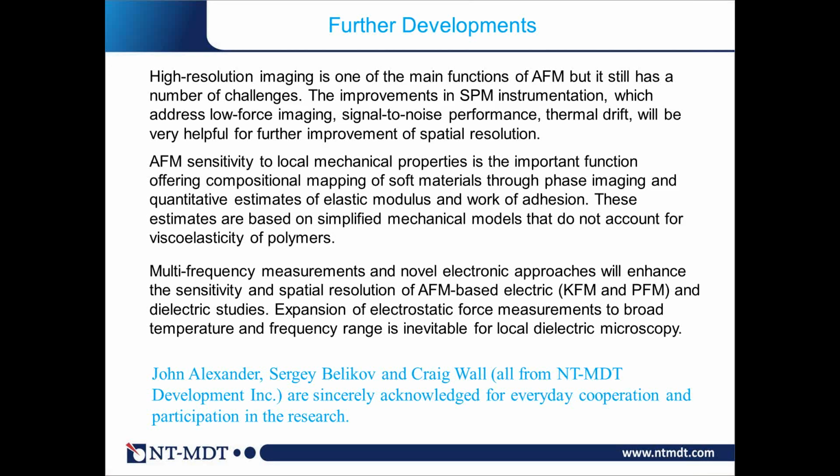Okay, Sergey. There's also a follow-up to the question about imaging cells in terms of peak force QNM. With that method, you can choose an appropriate frequency, and the comment is that good oscillations are not necessary. Can you comment on peak force QNM and its relation to these measurements, even though that's not a technique from NT-MDT?